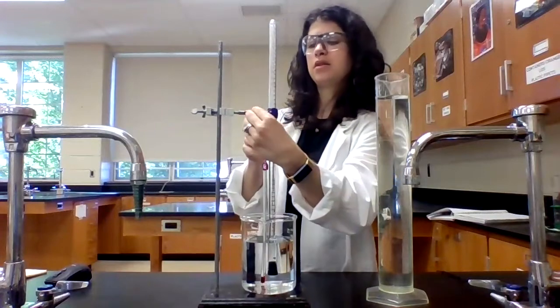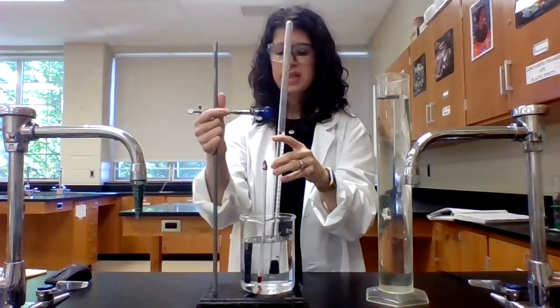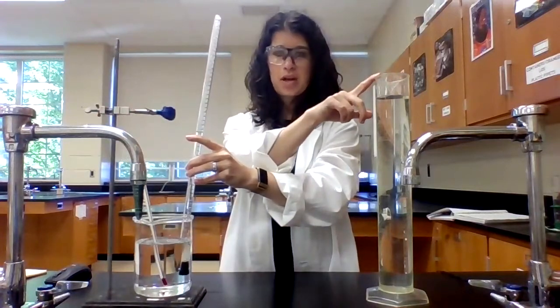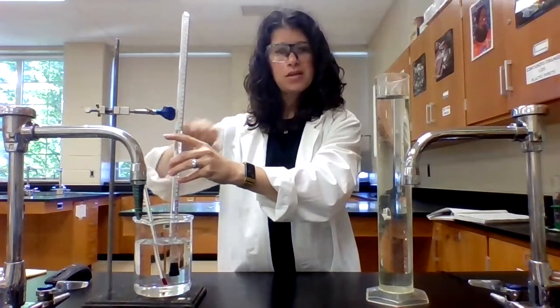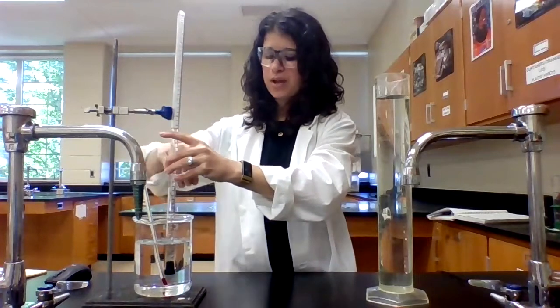So this is a little awkward to try to do, but what I need to do is take this eudiometer and put it inside this graduated cylinder. I am not interested in the volume of the graduated cylinder. I just needed water inside of it. I just needed a long tube. I do want to use my thumb again to cover the hole because I don't want any outside gas traveling inside the eudiometer.